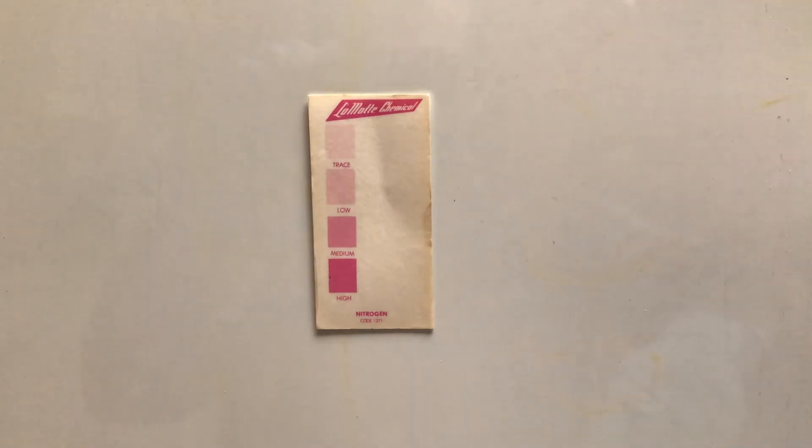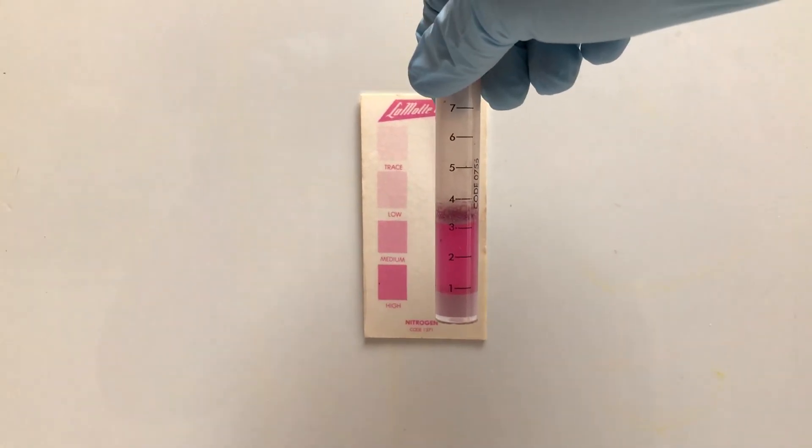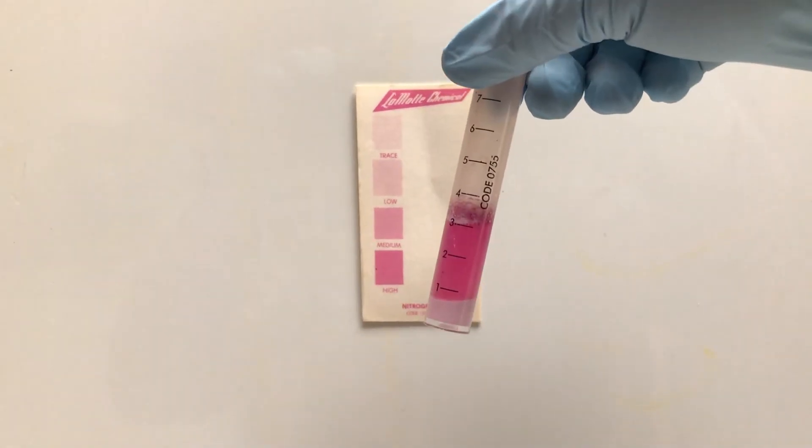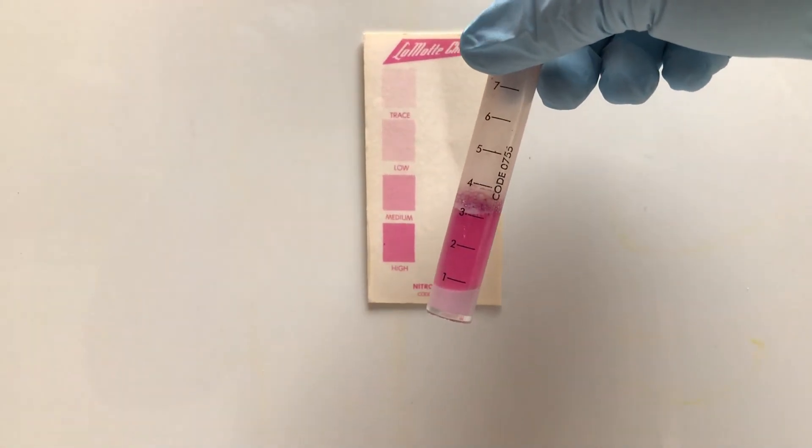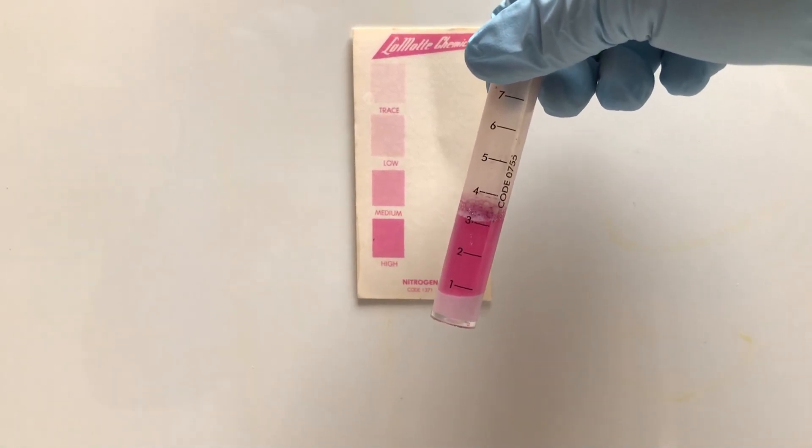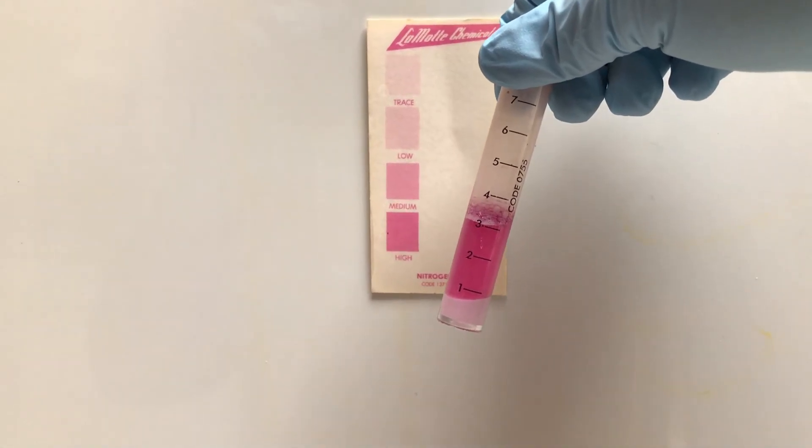Let's check out our suspect sample. We're looking at the clear area, that's gonna be a very dark pink color, so that would probably definitely be a high level. So remember to record those levels on your data sheets, and we'll continue with some more chemical testing.